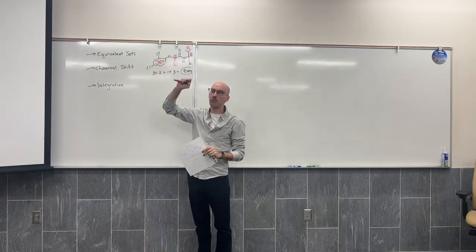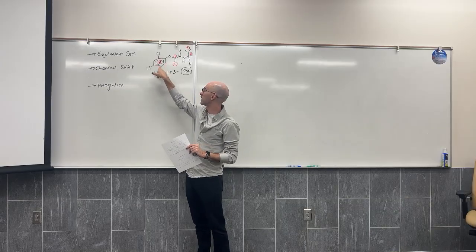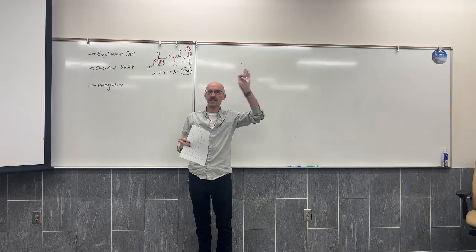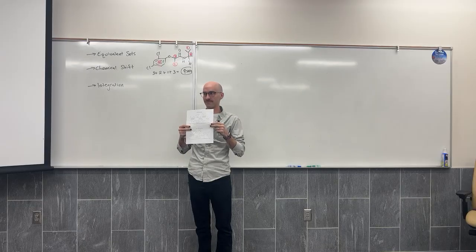And the aromatic ring does some weird shielding and de-shielding stuff. So I'm never going to ask you to predict which of these is furthest to the left. I'll leave that for your advanced spectroscopy course, if you're a chemistry major, that you'll take your senior year. Just so fun. I highly advise it.